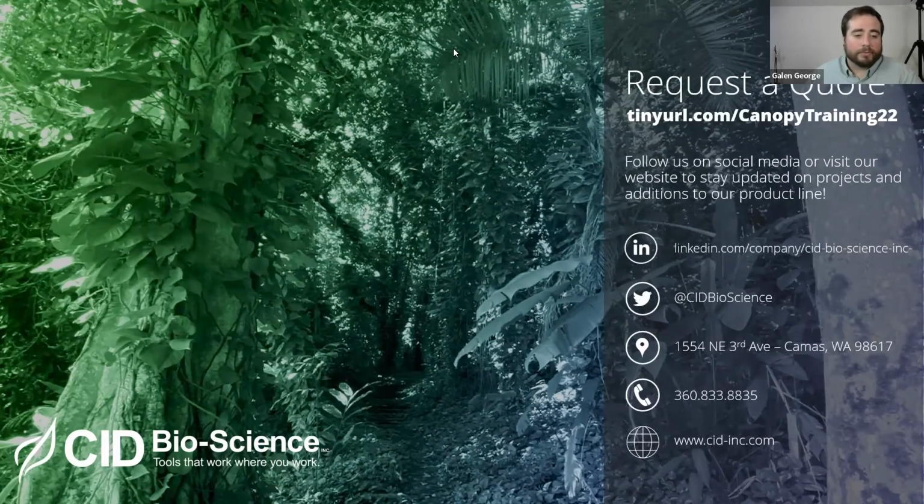The next question is from Jack Ingle. Hi, Jack. Good to see you. Is there any charge for the software updates? The answer to that question is currently no. When we update the software, we will have it on the website. We'll send out an announcement, and everyone will be able to just download that and update their instrument.